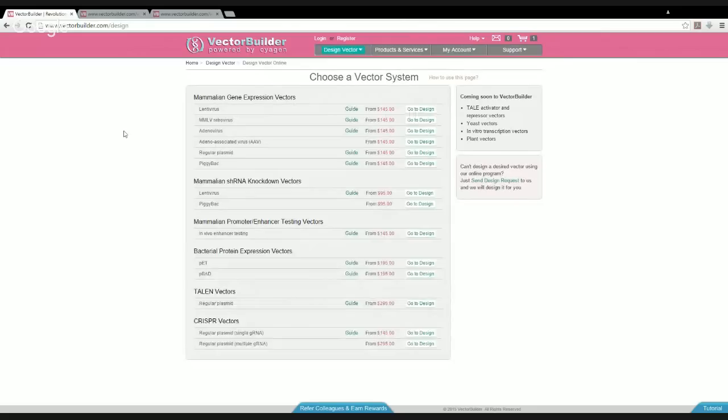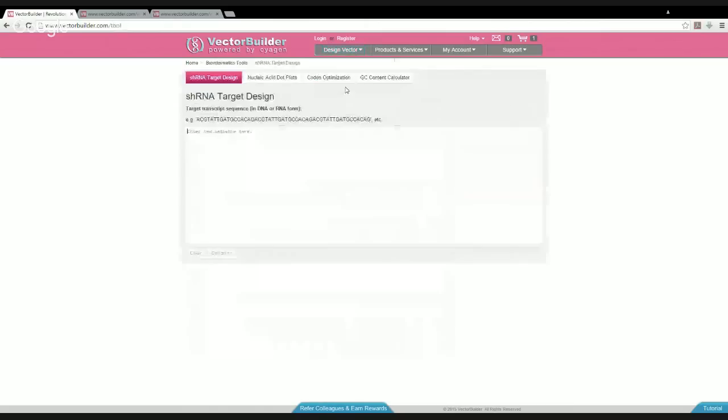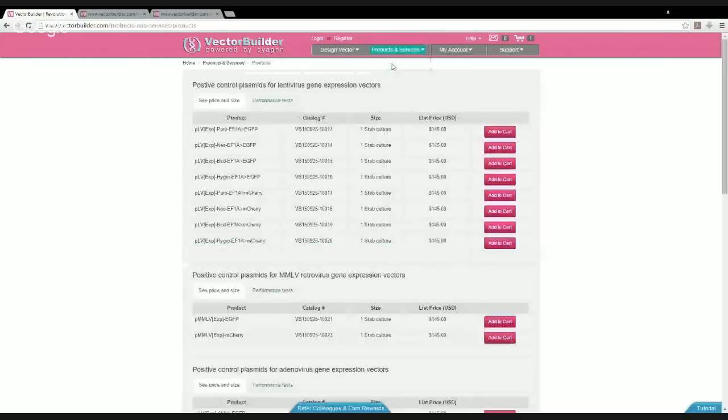We'll be having another couple webinar series in the future going over more advanced vector designs, including editing sequence manually, as well as some of the bioinformatics tools available on the Vector Builder website, including shRNA target design, codon optimization, and more. Similarly, on our products and services page, you'll have an option for positive control plasmids for each vector type, which you can add to your cart as well.